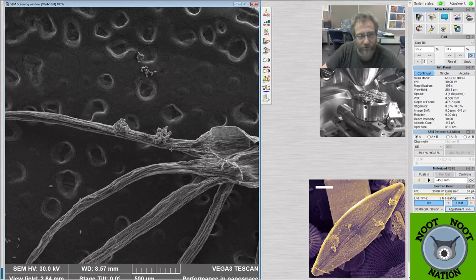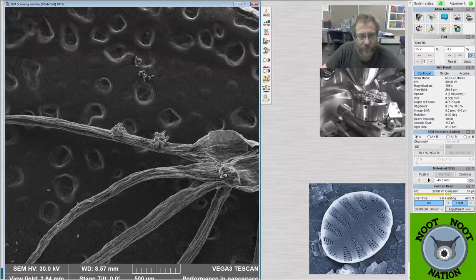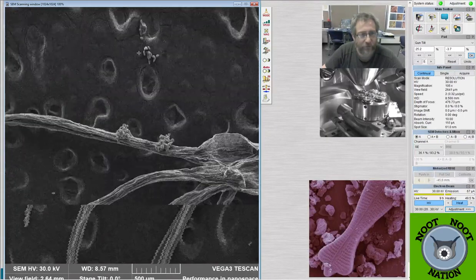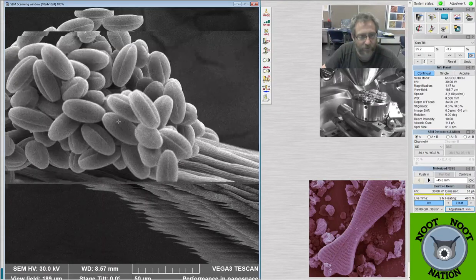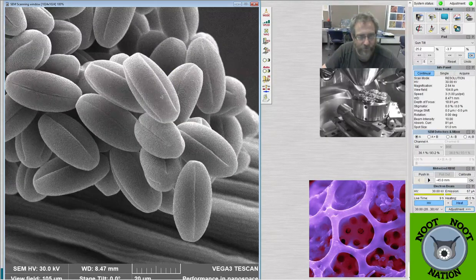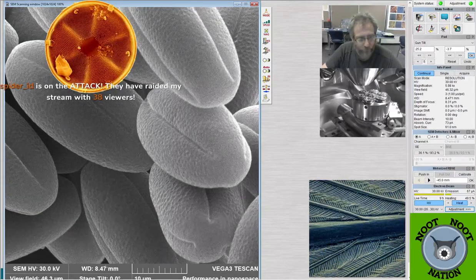We were zoomed in really closely just on a piece of one of the flower petals here. And I had to disassemble it, obviously, to put it into the scanning electron microscope. So I was just zooming in to try to get some nice detailed imagery, but it looks like the pollen is pretty obvious on it. These little clusters right here are all pollen. And let's see if I can get that in a little bit better focus for us. One of the things you can see is that the surface is dimpled. They're long. They've got three-fold symmetry.